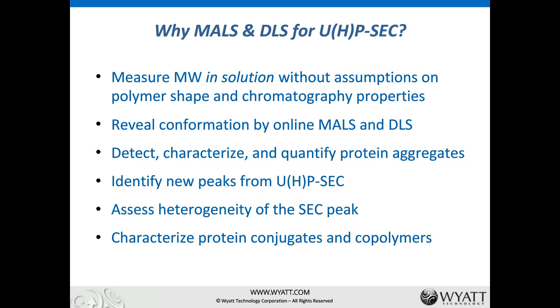Molecular weight is measured in a fraction of a second, so we can plot all the molecular weight data points across the SEC peak, looking for impurities and signs of on-column dissociation. SEC-MALS is also an important tool to characterize protein conjugates, such as pegylated proteins and glycosylated proteins.